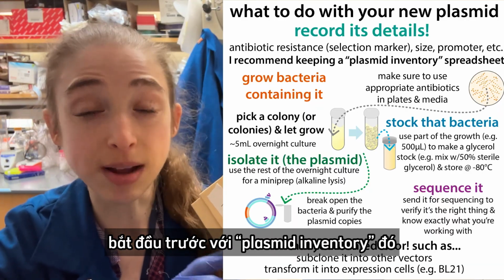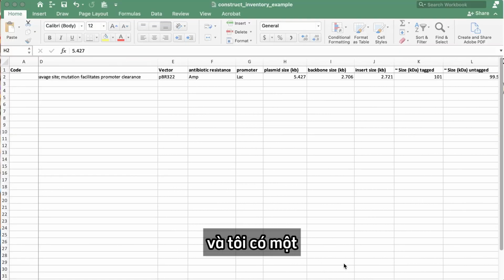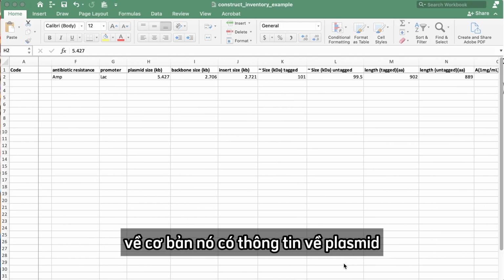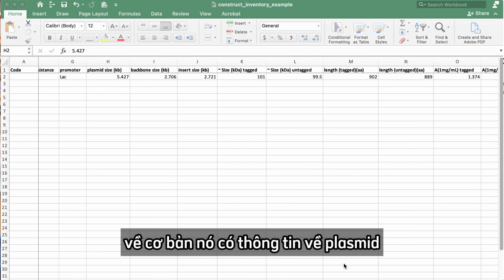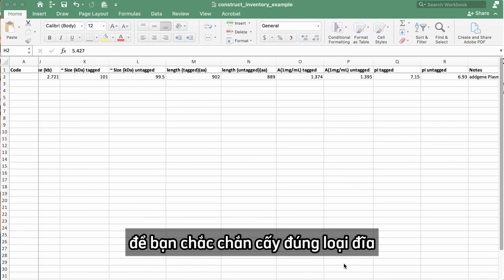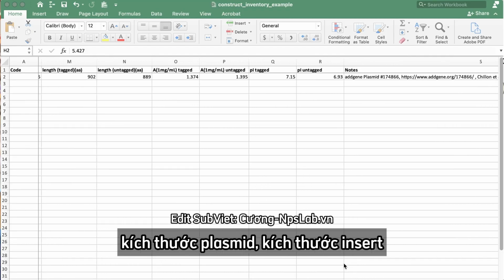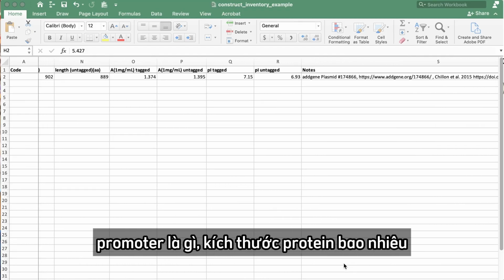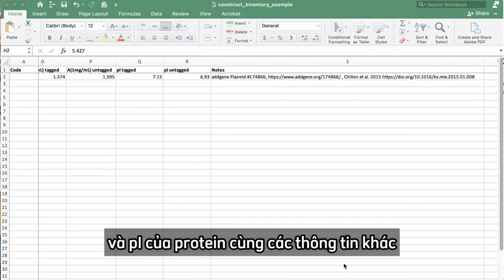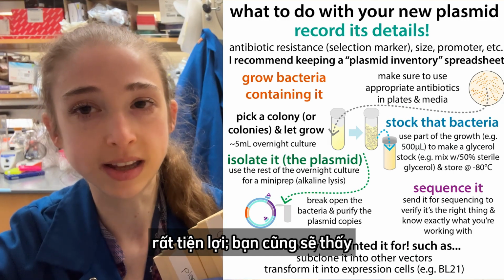So first, starting with that plasmid inventory, I've done a post on this before, and I have a template that you can go and download and use for yourself. Basically, this has information about the plasmid. This includes antibiotic resistance, so you make sure that you plate it on the right plates. Plasmid size, insert size, if it's for protein expression, what's the promoter, what's the size of the protein and the pI of the protein, and all this various stuff. Having it all in that one spreadsheet makes things really, really handy.